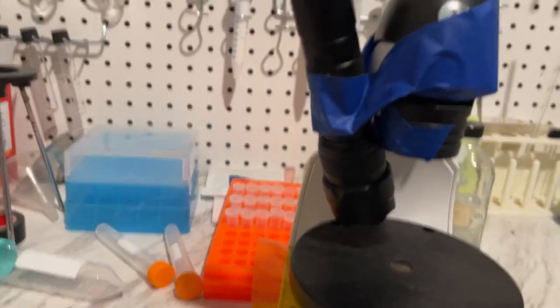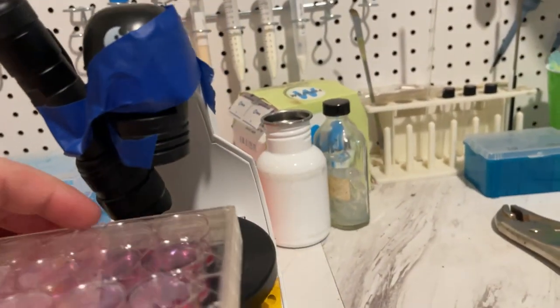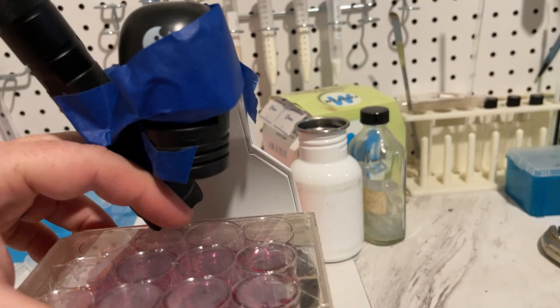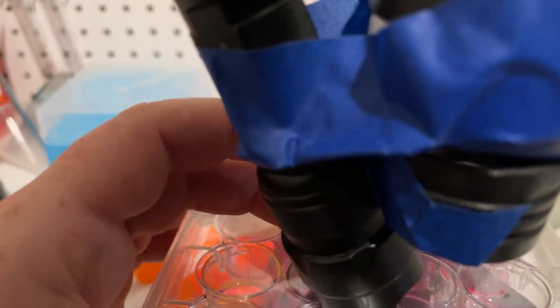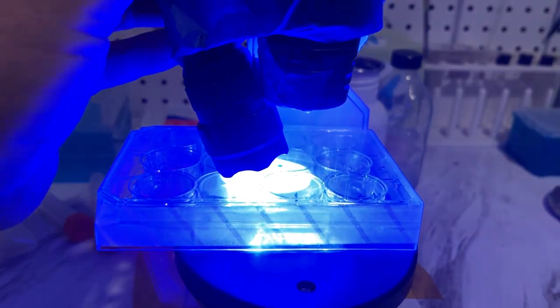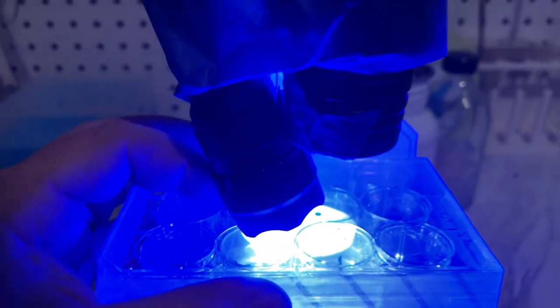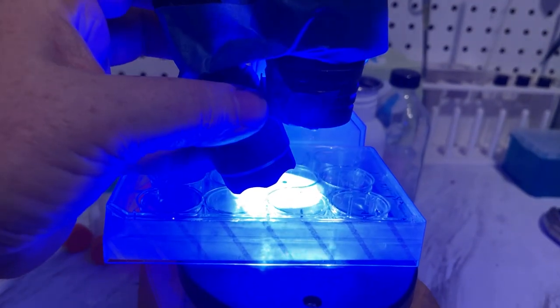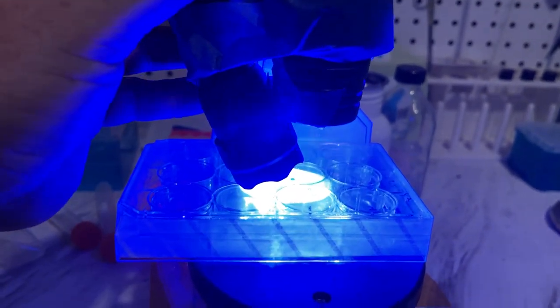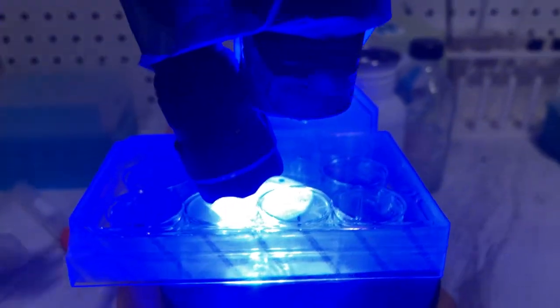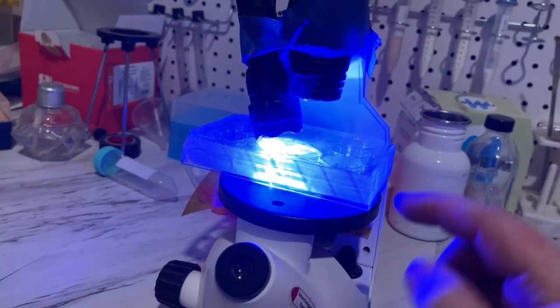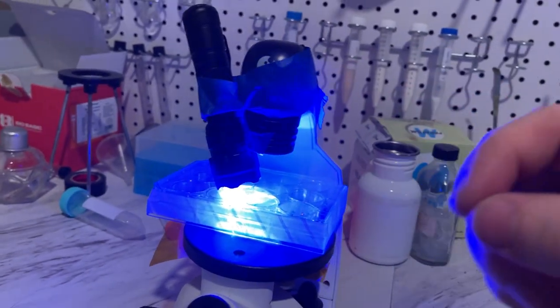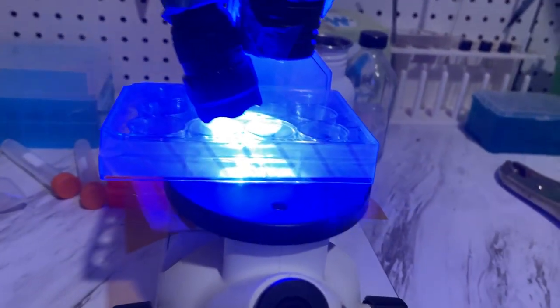Now, what will happen is, the light, the blue light will shine on the cells. The blue light will get filtered out here. But the green light, being made inside the cells by the GFP fluorescence, will still be visible.